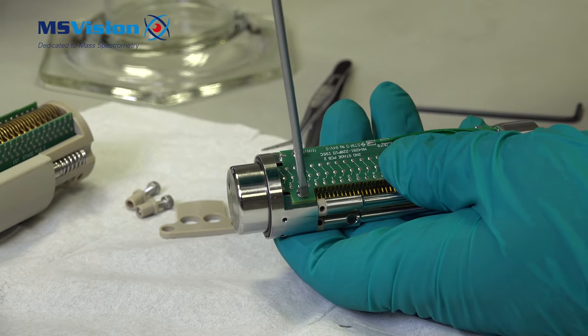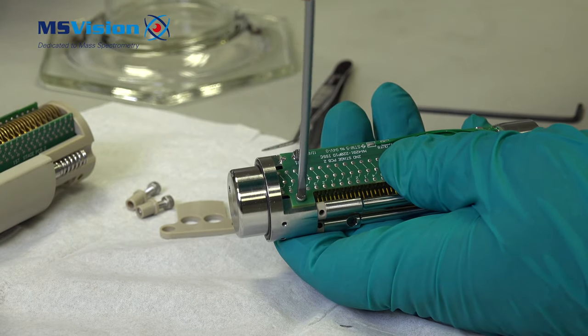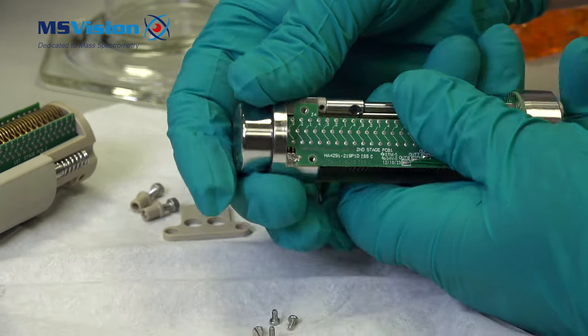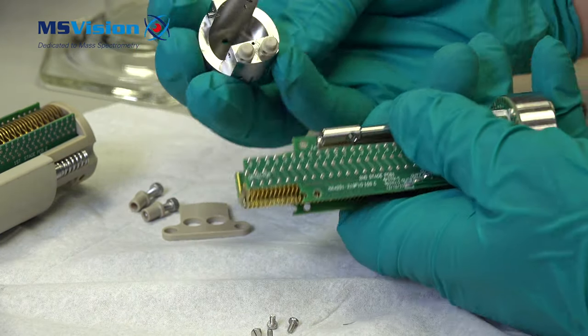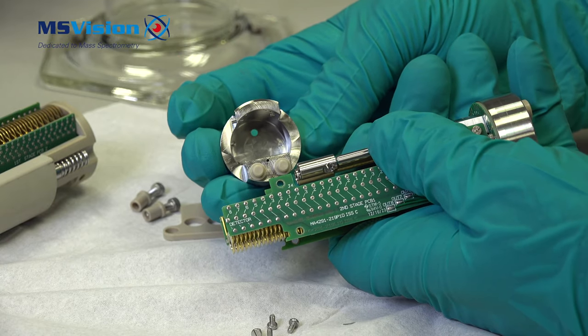Next, remove these four screws being careful not to drop them. Now we can take the top hat off. Inside around the hole you can see a black ring that needs to be cleaned.